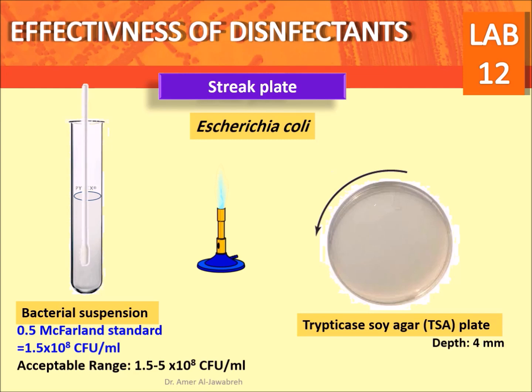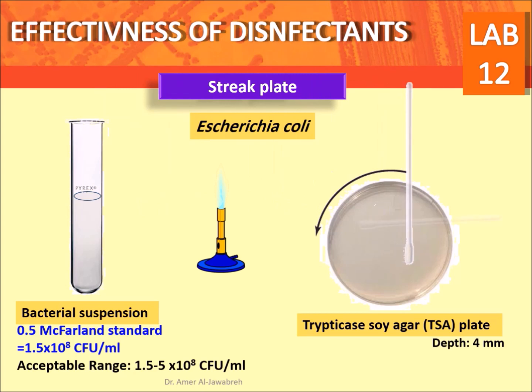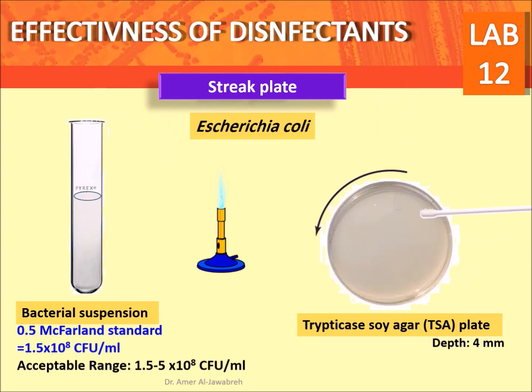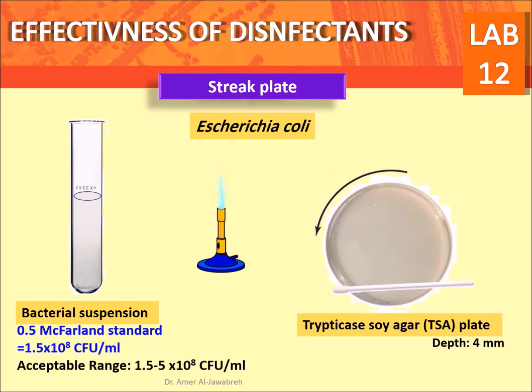Squeeze the swab against the walls of the tube. Streak the swab vertically, horizontally, and on the rim of the TSA plate. Cover and allow to stand for 5 to 10 minutes.